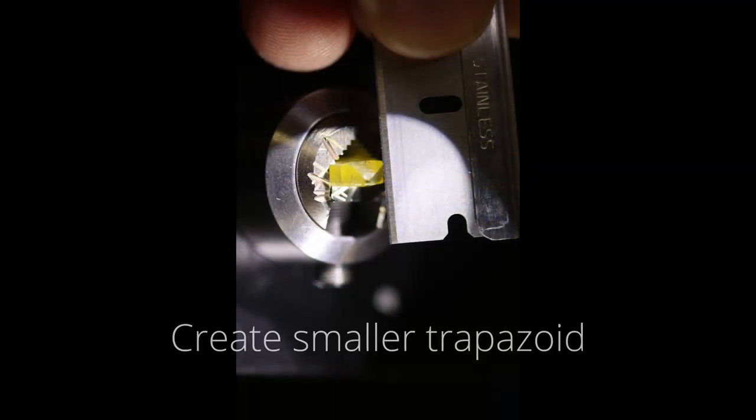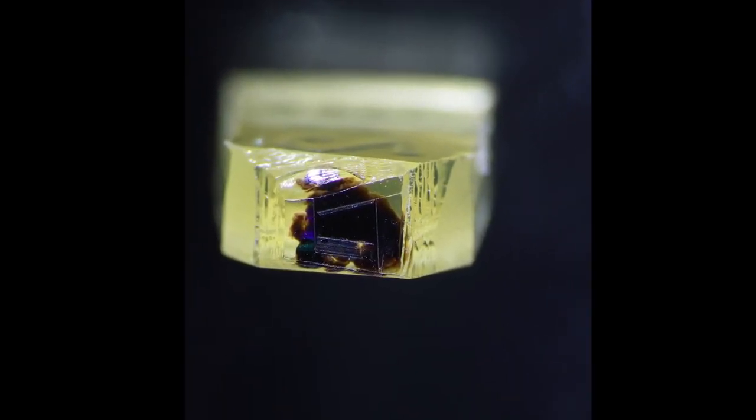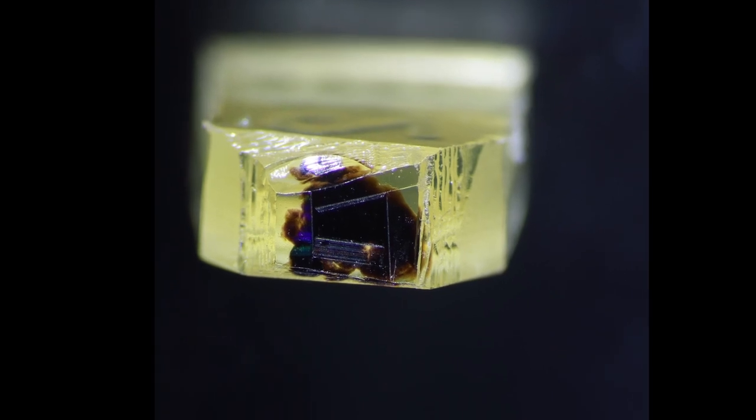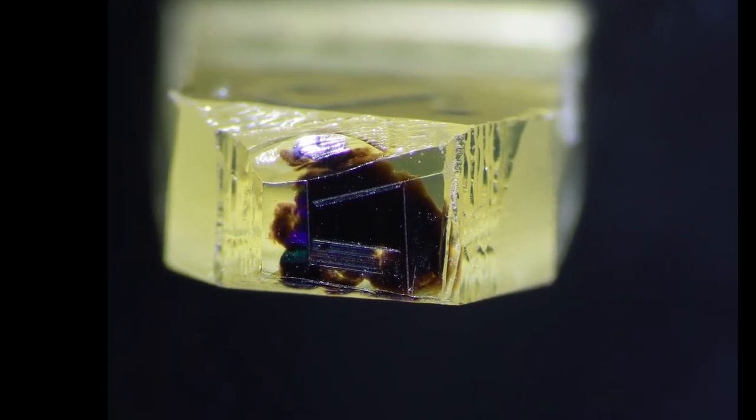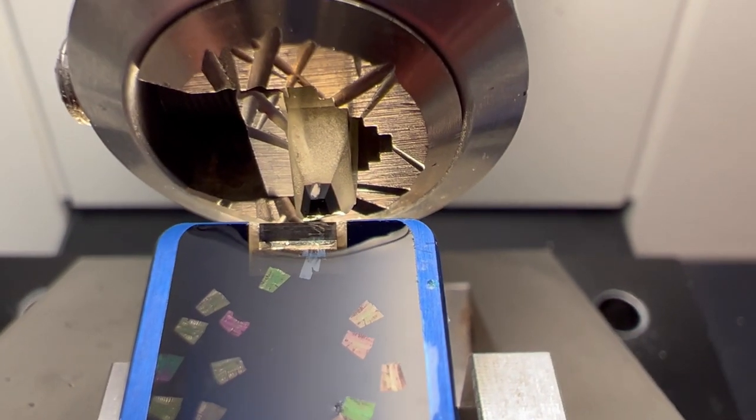Then I take that epoxy specimen. I create a smaller trapezoid on top of the larger trapezoid for our 70 nanometer sections. You can't section at 70 nanometers with larger trapezoids.